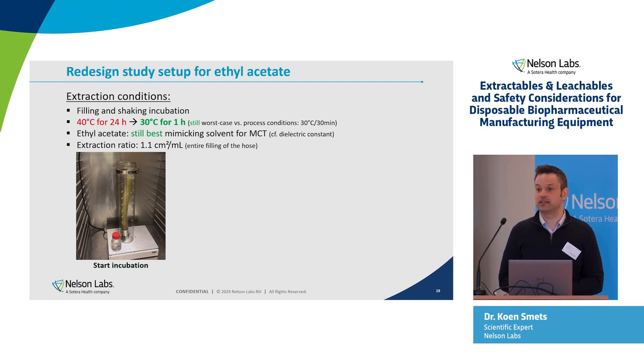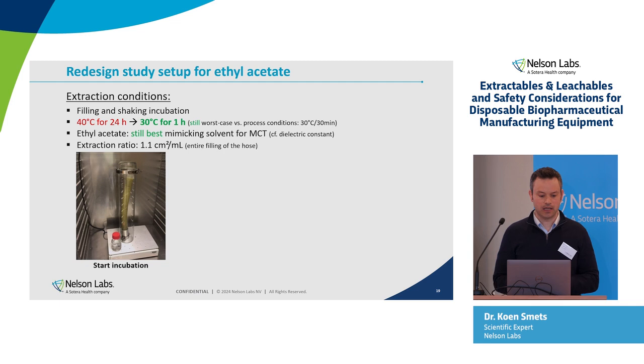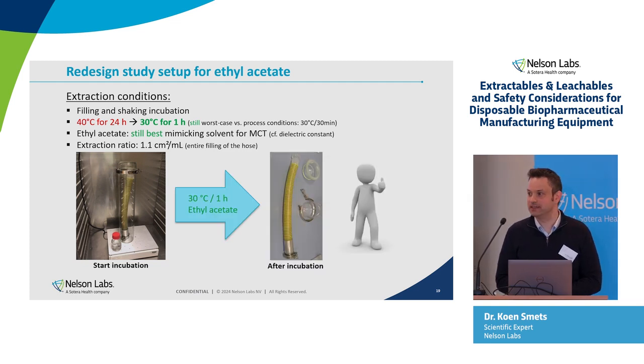Ethyl acetate was still selected as the extraction solution, because we were convinced that's the best mimicking solvent to use, and therefore also providing the most relevant extractables data. And again, filling and shaking incubation was used. So at the beginning, the same experiment was performed, now in a glass vessel, to be sure that there are no leaks during this process. After these conditions, luckily we found an intact test item afterwards, and we could recover extract successfully that could be analyzed on the analytical instruments.